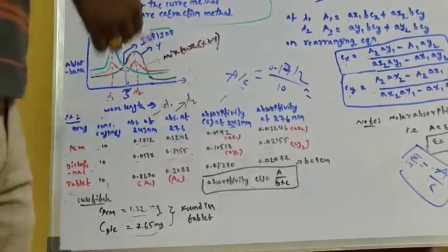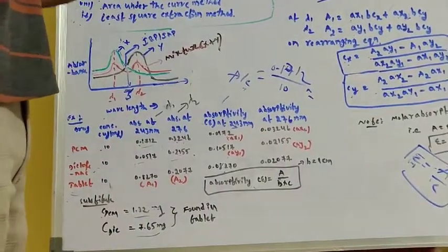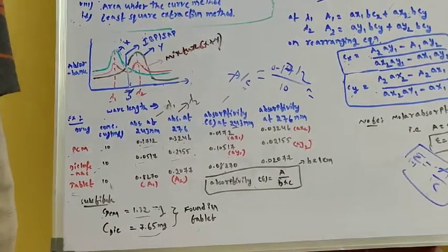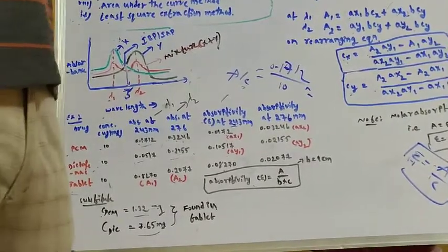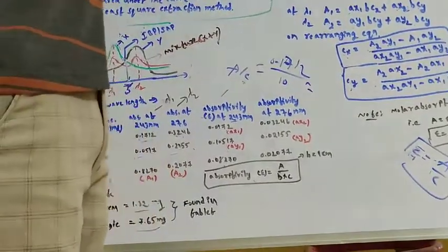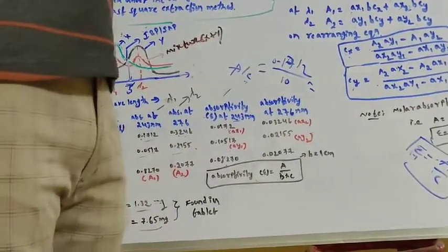By this way we can determine the concentration of components if two or more than one are present in the solution. This is about single component analysis and multi component analysis. Thank you.